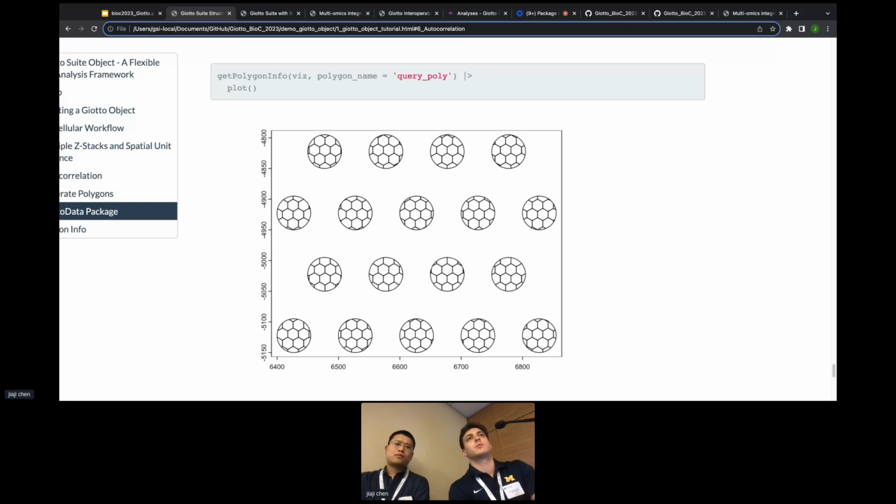We've taken steps to reduce the amount of dependencies by removing certain packages from our imports and putting them in our suggests, as well as putting them in certain functions saying, if you want to run this kind of analysis, you need to download this package before running it, keeping these kinds of situations in mind. However, that would be an aspect of setting up before running any sort of interoperability command between the two.